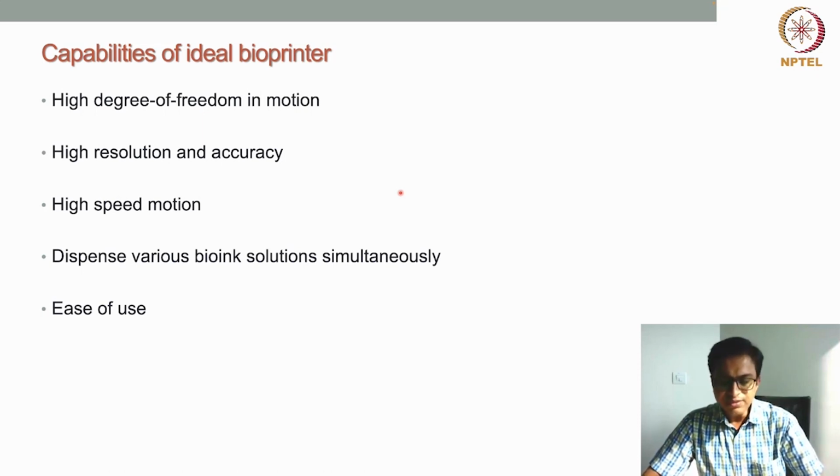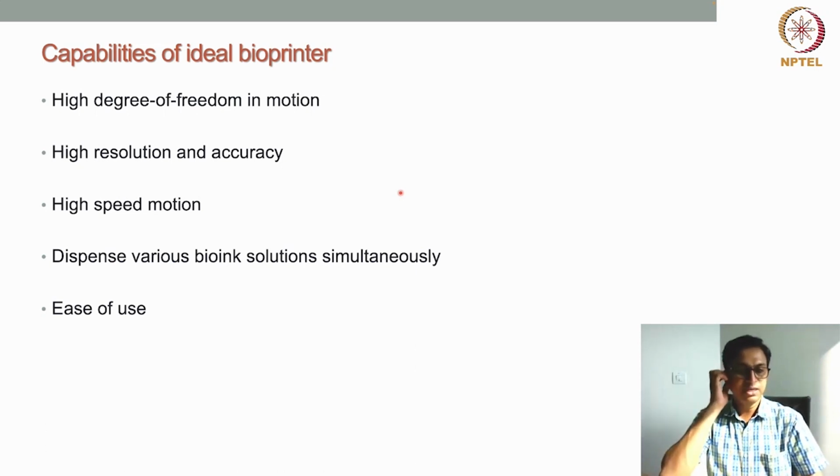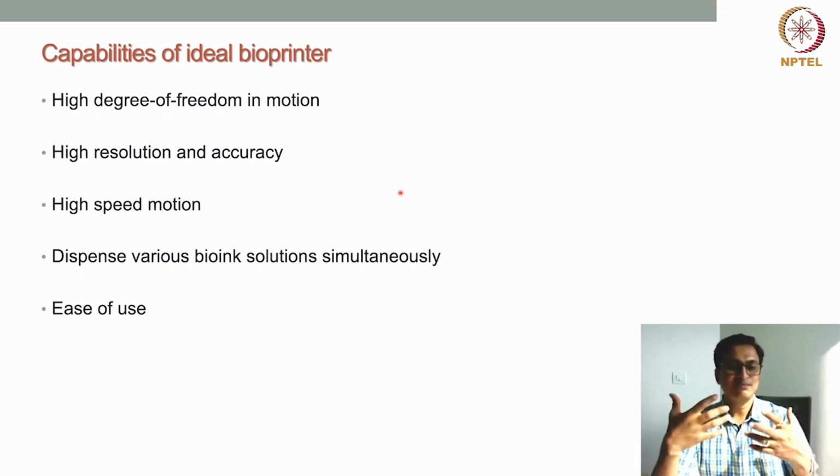Now this bioprinter should be user friendly. There should be less skill and knowledge required to run a bioprinter. Otherwise, what will happen? We have to train people. Now, training is one important component, definitely, but the skill development is another major challenge, right?